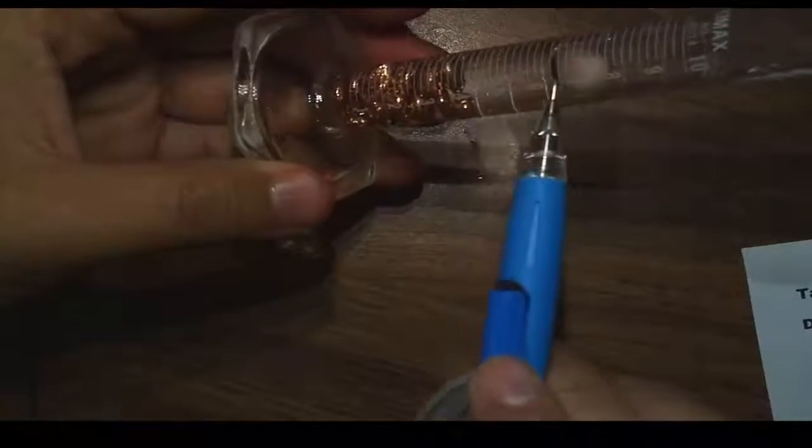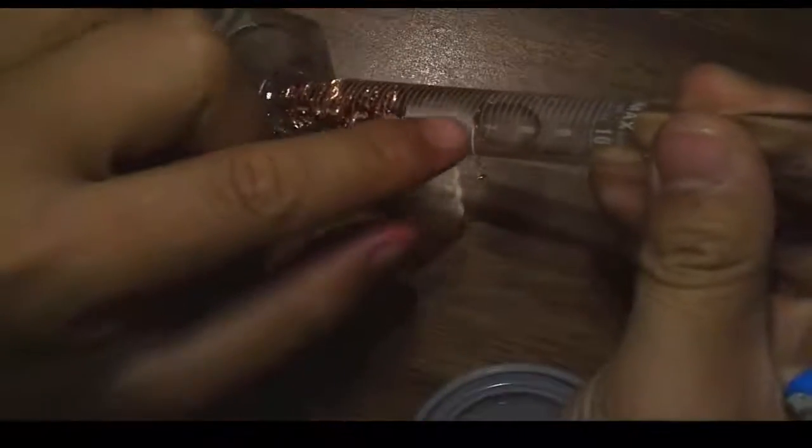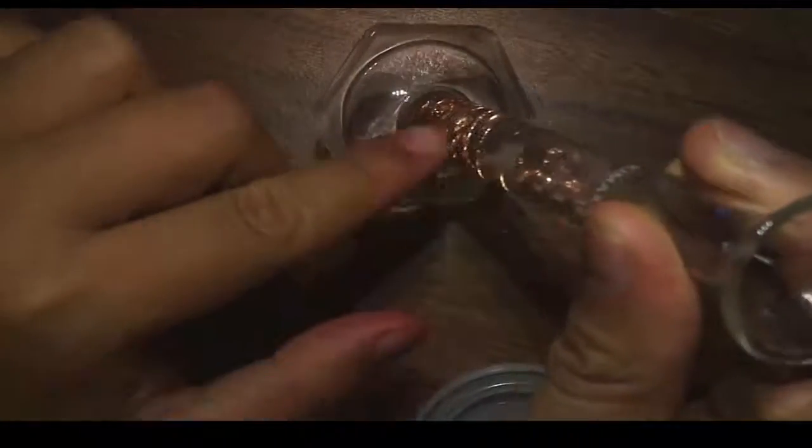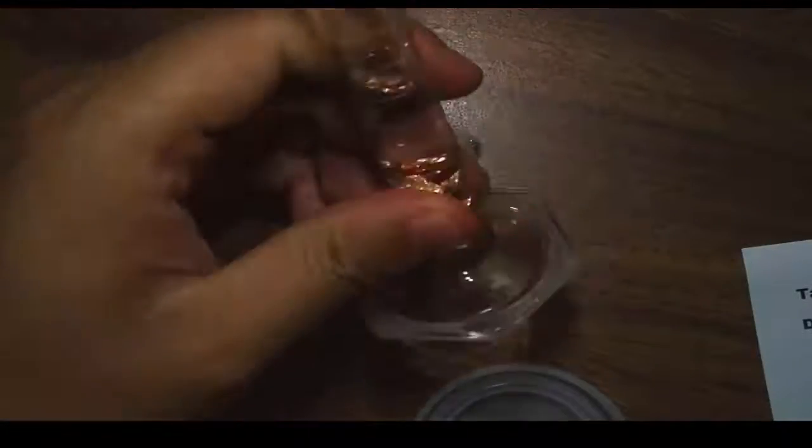And notice how the copper displaces the water, so the volume goes up. Now our reading is about 7 something, which is not how you're supposed to read the reading. But you can see that there is a change in the volume of the water, a change in the reading level. And that is water displacement. We can use this method to find the density of copper if we want to. So keep that in mind.